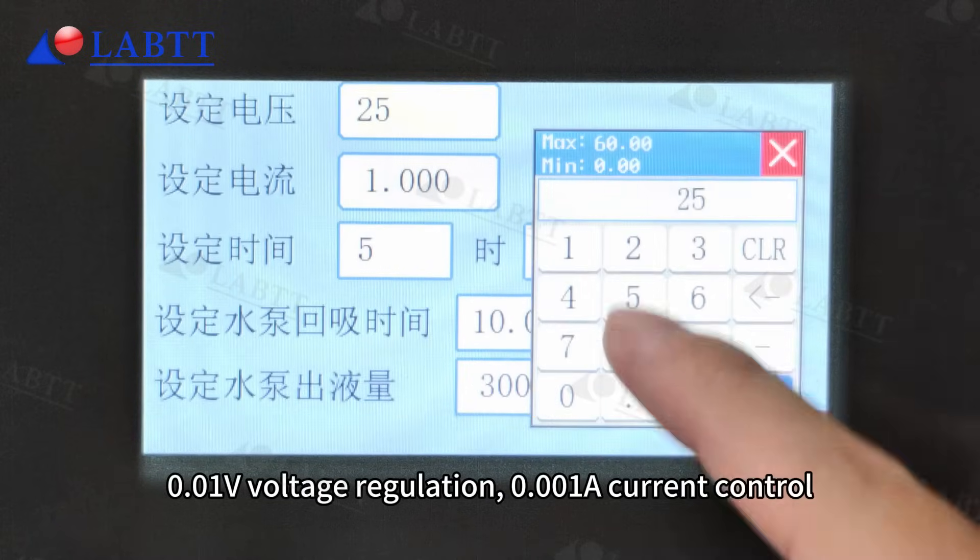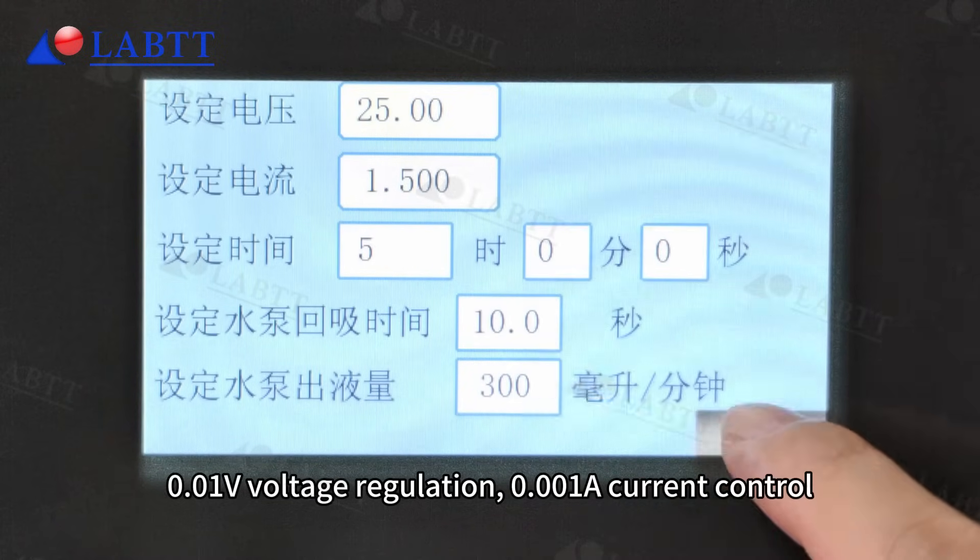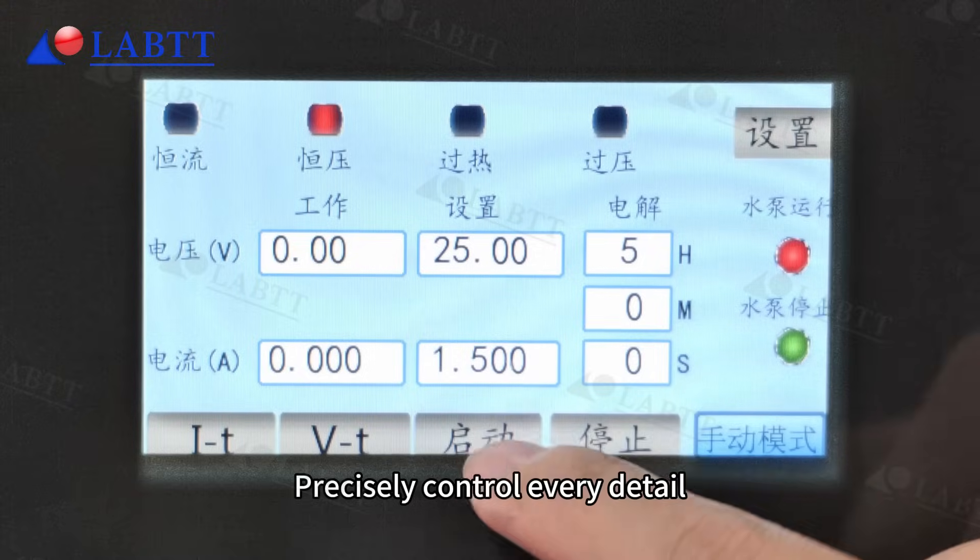0.01 volts voltage regulation and 0.001A current control precisely control every detail.